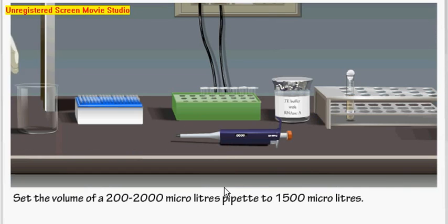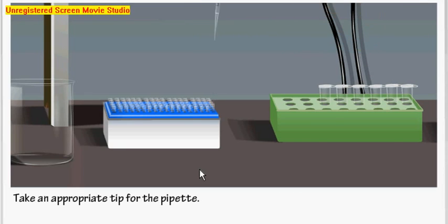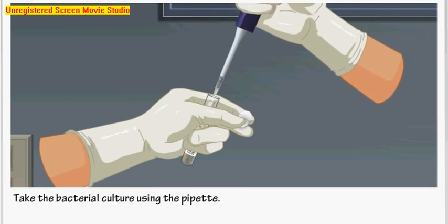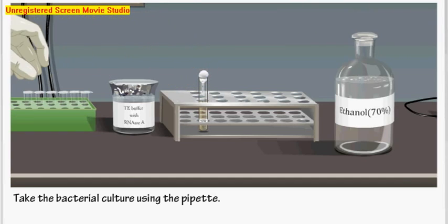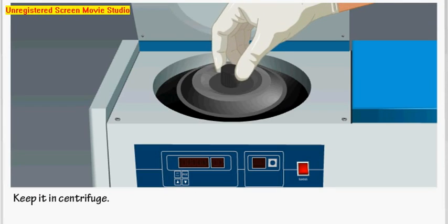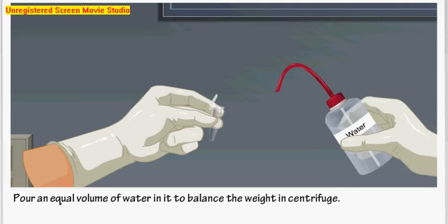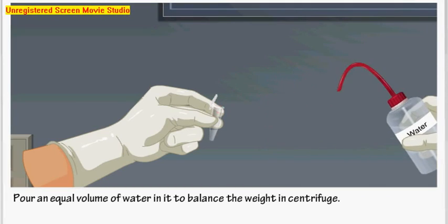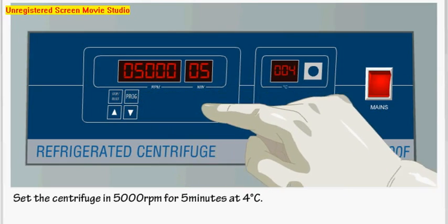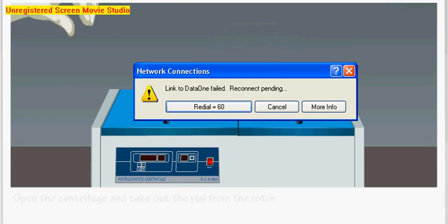Set the volume of the micropipette to 1500 microliters. Take appropriate tips for the pipette and take 1500 microliters of bacterial culture. Pour it into a microcentrifuge tube (Eppendorf). Pour an equal volume of water into a balancing tube, then close the lid. Set the centrifuge to 5000 rpm for 5 minutes at 4 degrees Celsius. This is the first centrifugation in the process.